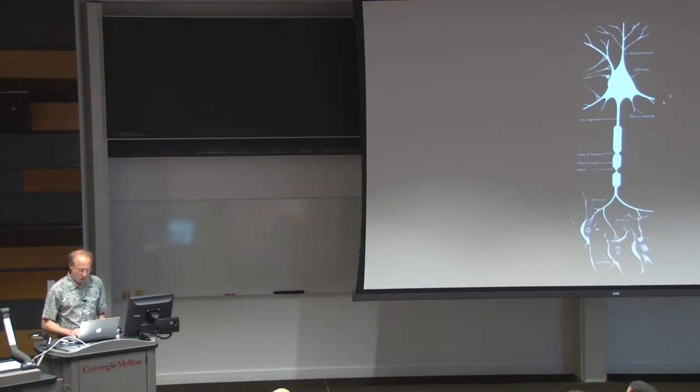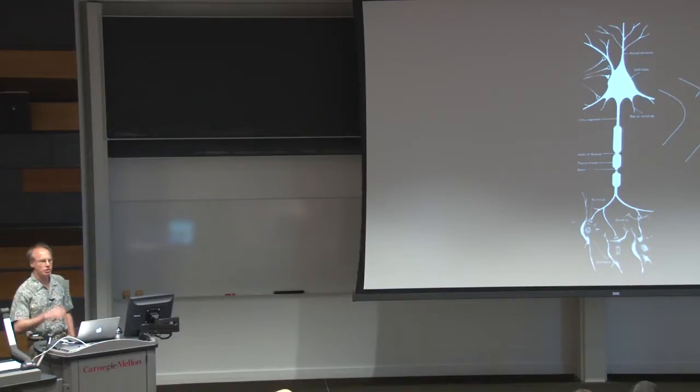What we're going to do to monitor what's going on is to record electrical activity. The way neurons communicate is that they integrate these inputs, and then there's a nonlinear threshold on these analog inputs, and if you reach it, the neuron fires an action potential. We can't really see the inputs very well, but we can watch the action potentials by putting a microelectrode in the vicinity of the neuron and intercepting the electric field that's generated when you get an action potential. So you put a microelectrode in and you record that activity. I'll show you some examples of that.